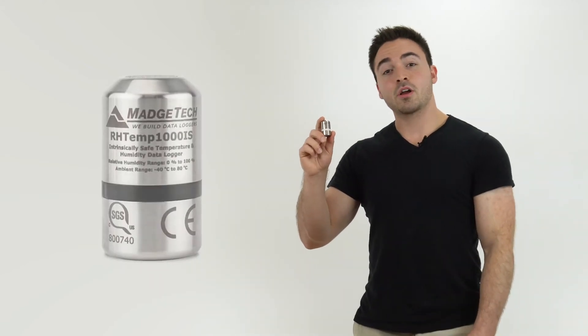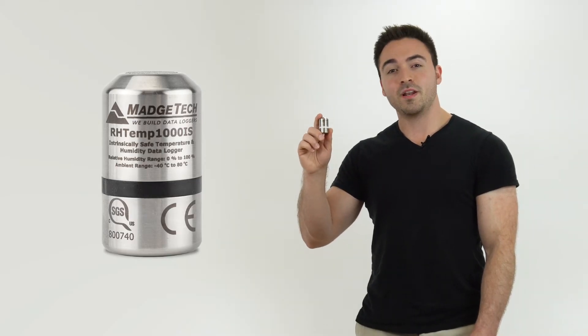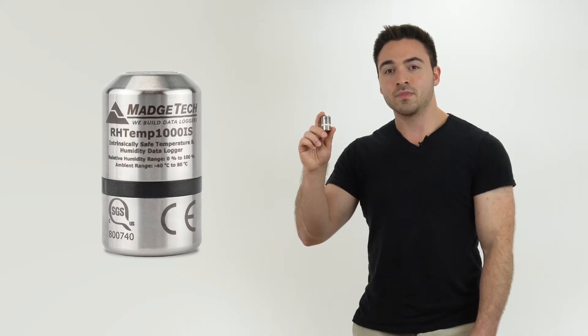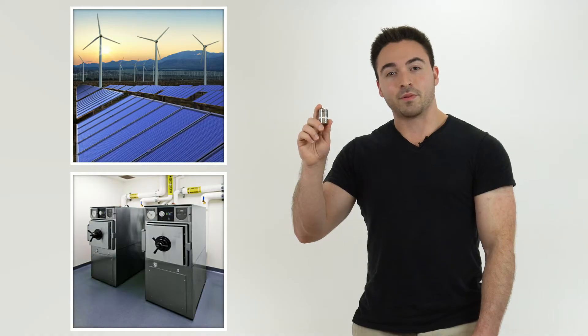Hey everyone, my name is Eric and today we're talking about the Rhtemp 1000IS Data Logger. This is a food grade stainless steel temperature and humidity data monitoring device that has been SGS approved as intrinsically safe in hazardous environments. This certification makes the device ideal for ETO sterilization, environmental studies, and numerous other hostile environment applications.